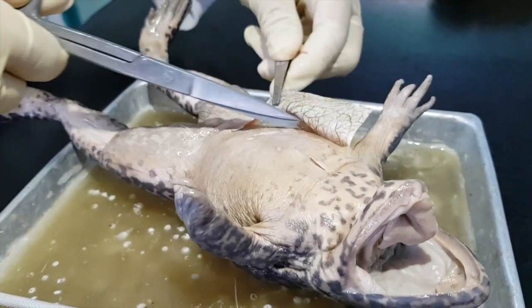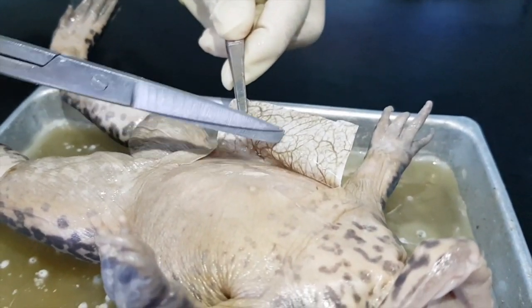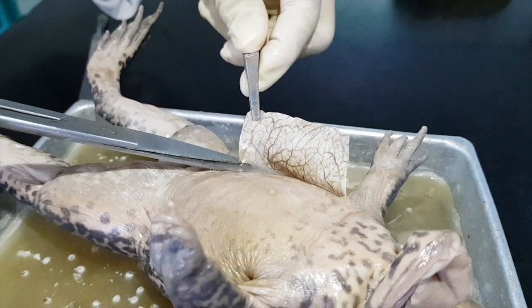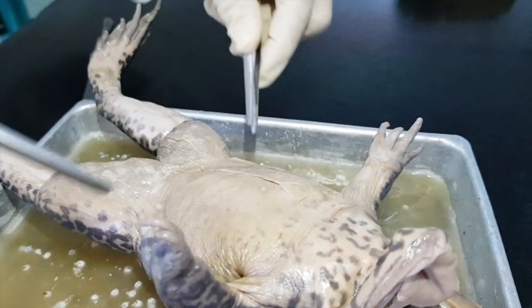Look at the part of the skin where lots of blood vessels are present, so it's highly vascularized to effectively use cutaneous respiration for this species.